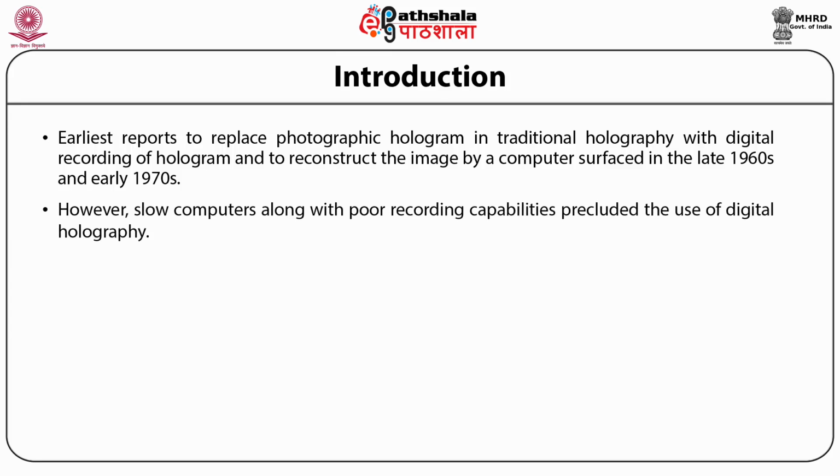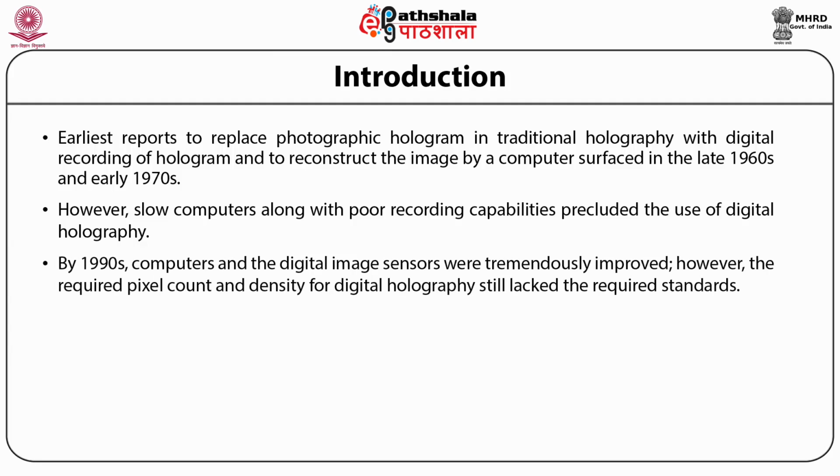However, slow computers along with poor recording capabilities precluded the use of digital holography. By the 1990s, computers and digital image sensors were tremendously improved. However, the required pixel count and density for digital holography still lacked the required standards.